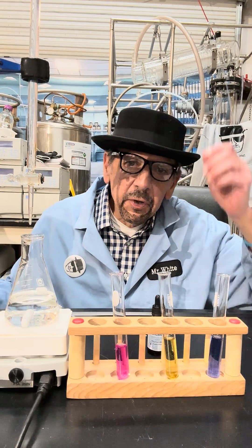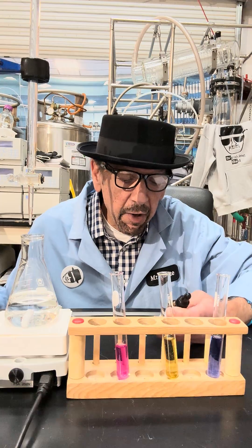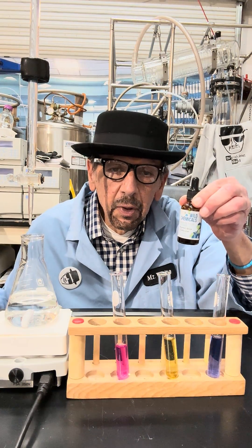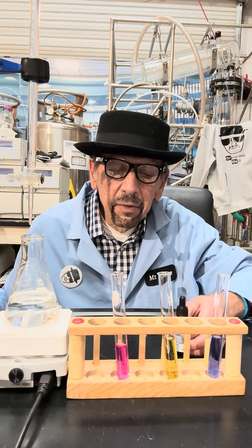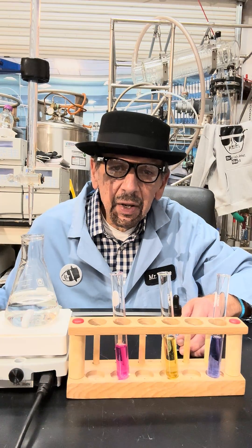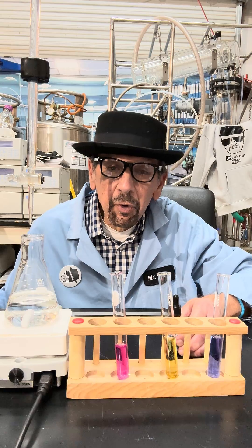Hey folks, today we're going to do another titration experiment using Thymol Blue. It's a dual-action indicator that has a few color changes depending on whether it's acidic, neutral, or basic.